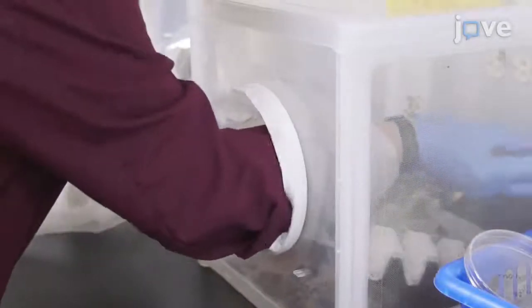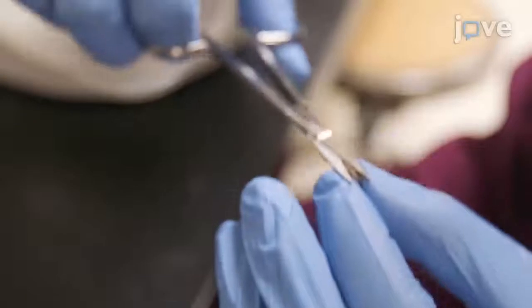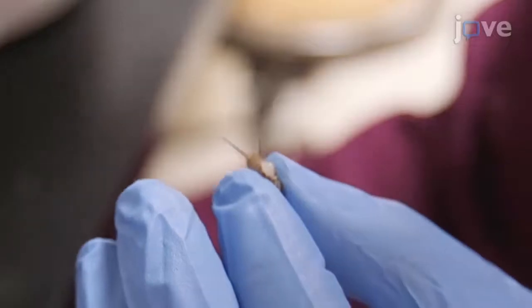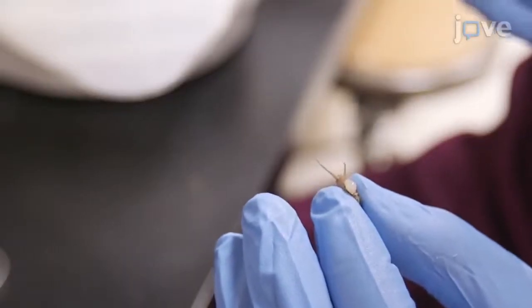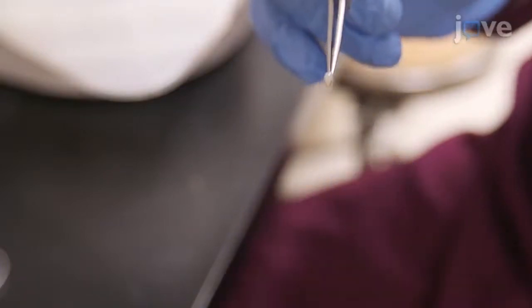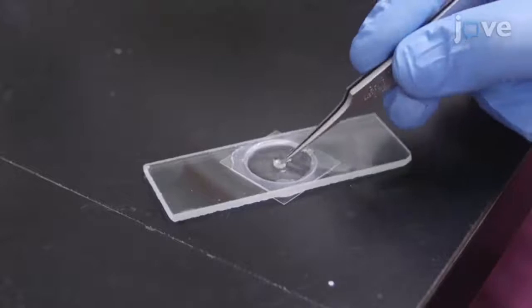After obtaining sub-adult male crickets, use dissecting scissors to cut through the dorsal surface parallel to the long axis of the abdomen, directly behind the wing buds. Then, gently squeeze the abdomen to push the testes through the cut in the exoskeleton. Using forceps, place the isolated testes into the dissection well.